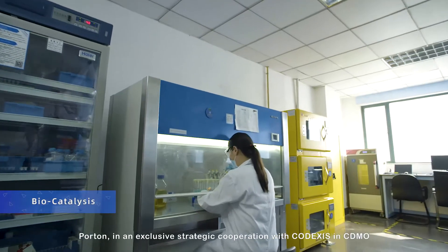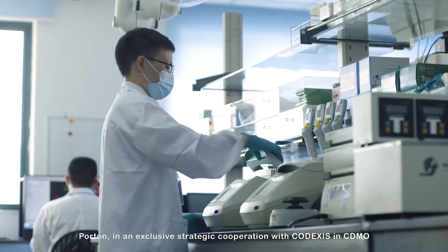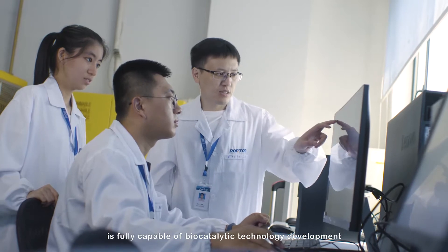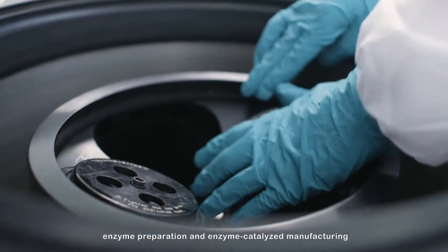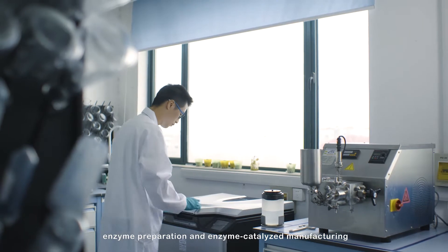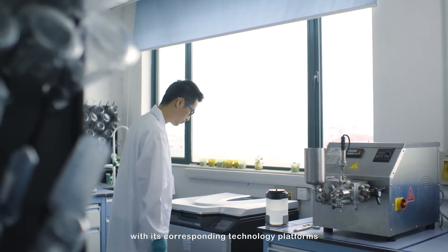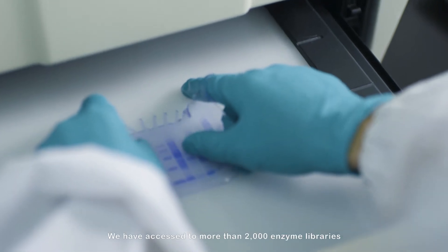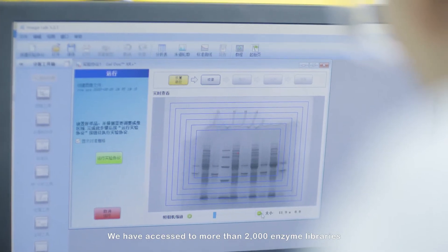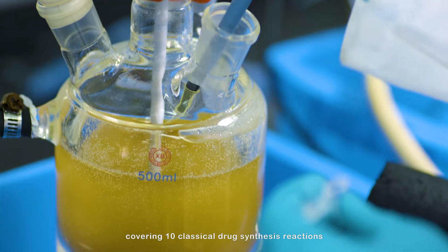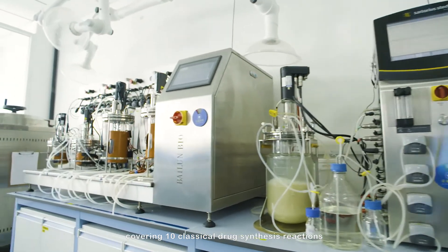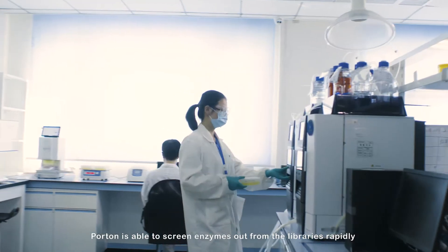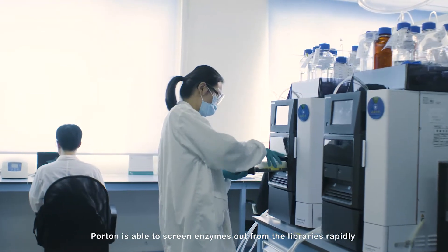Porton, in an exclusive strategic cooperation with Codexis in CDMO, is fully capable of biocatalytic technology development, enzyme preparation and enzyme-catalyzed manufacturing with its corresponding technology platforms. With Codexis authorization, we have access to more than 2,000 enzyme libraries, covering 10 classical drug synthesis reactions. With its high-throughput screening platform, Porton is able to screen enzymes out from the libraries rapidly.